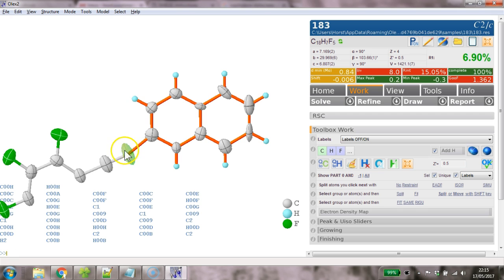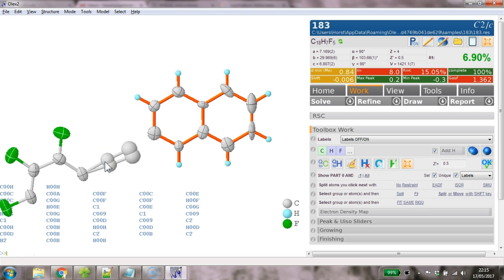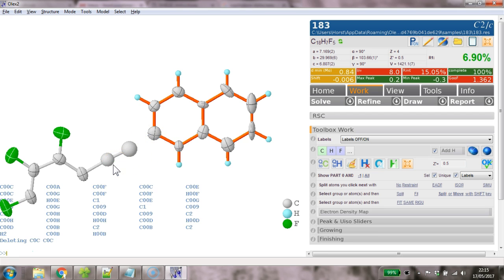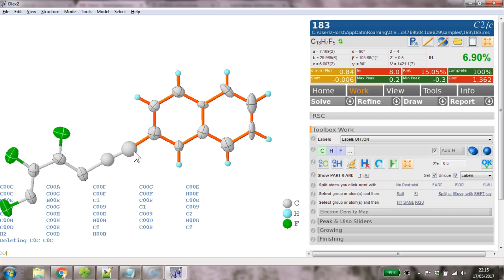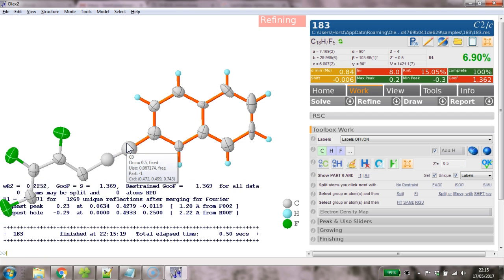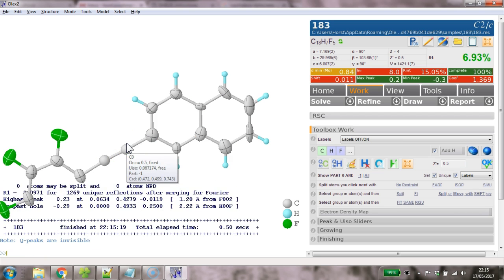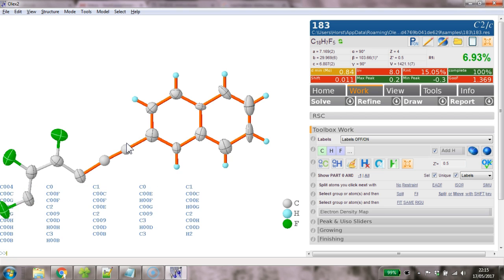Now we need to also split these ones. So we split them and this one isn't going to go in the right place, but these ones we can delete. And these ones also go into part minus one and 0.5. And we refine that just to switch this PV on again. Every time the atom list changes in any way, this sort of view goes lost again.